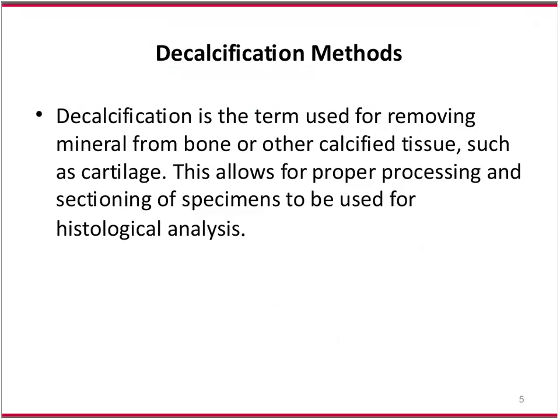So most of us already know that decalcification is the term used for removing mineral from bone or other calcified tissue, such as cartilage. This allows for proper processing and sectioning of specimens to be used for histological analysis.